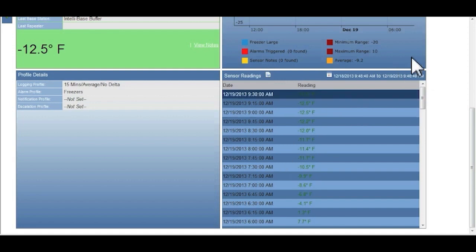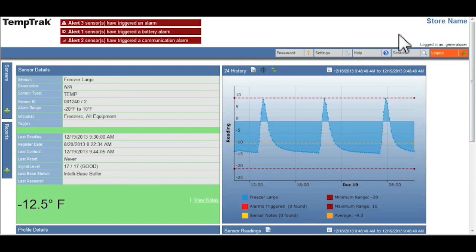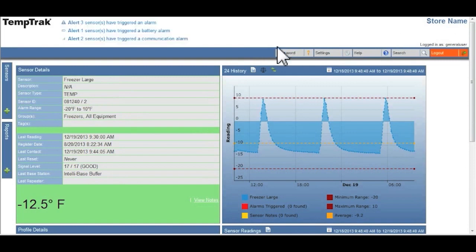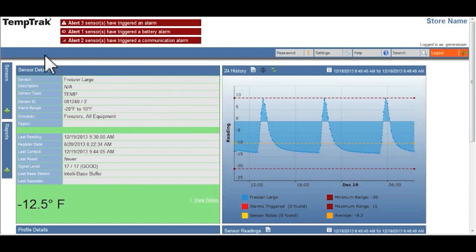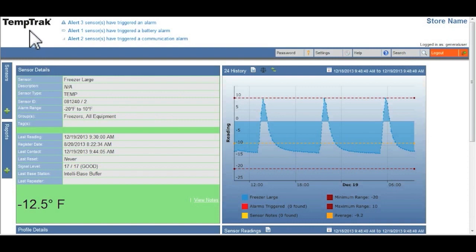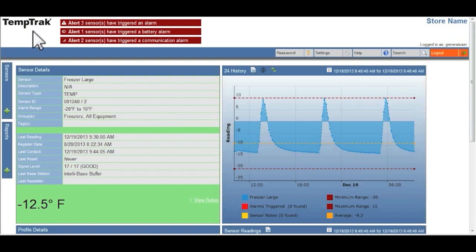Once you have reviewed all the detailed information that you need on the particular sensor you're interested in, remember that you can always go back to your dashboard screen by clicking on the TempTrack logo in the upper left hand side of the page.